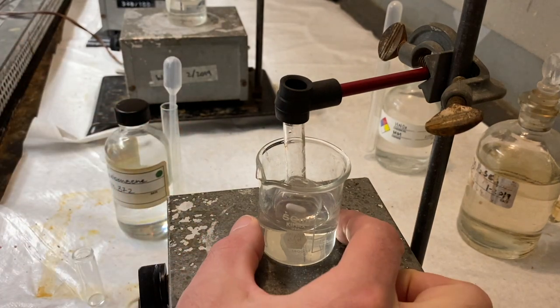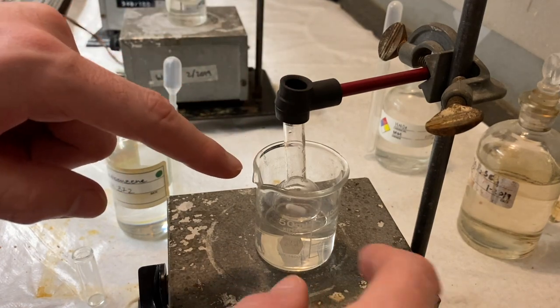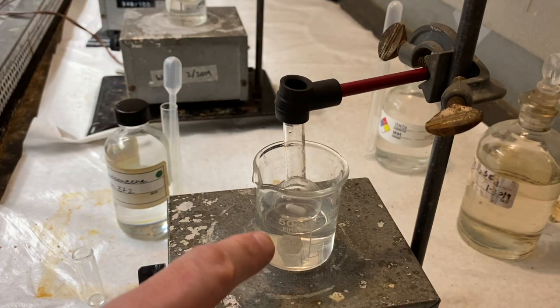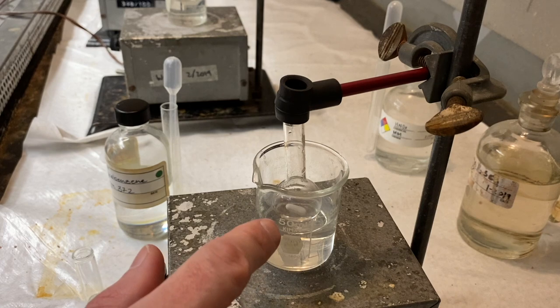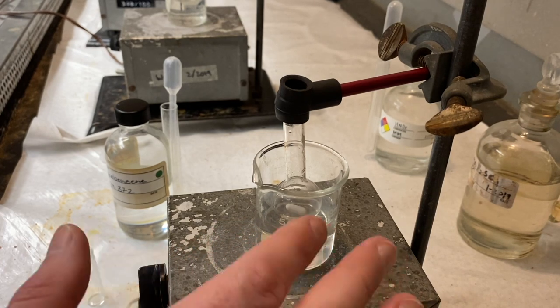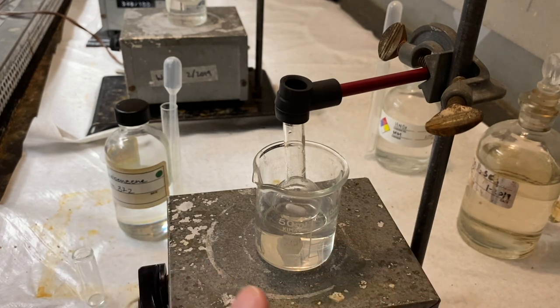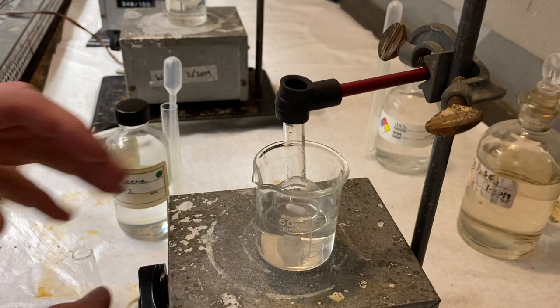We have this in a beaker. There's a round bottom flask sitting inside of the beaker. And this beaker is about halfway full of cool water. And that's just to help moderate the temperature of the reaction, because this is an exothermic reaction. And we want to be careful with it.